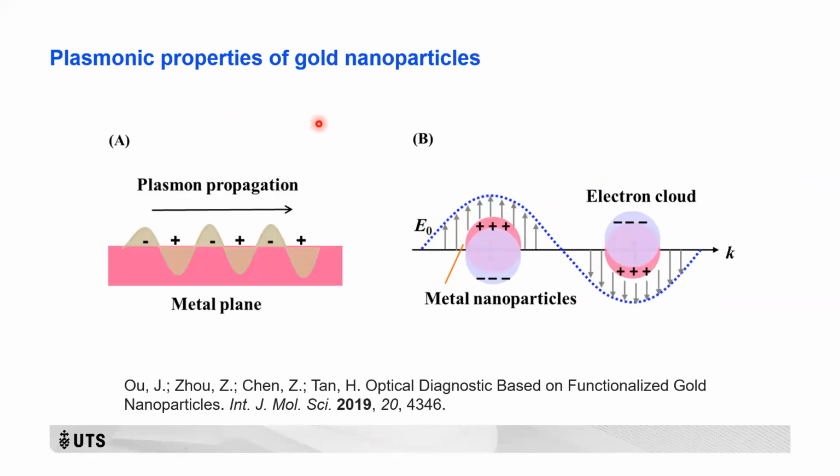So I explained the plasmonic property last time. So here, just a little refresher. And also the way that we use it to check whether our antibody conjugation is successful or not is also because of their plasmonic property, but not in the same way as when they're used as a reporter in LFA, and more based on their sensitivity to the refractive index changing around the golden nanoparticles.